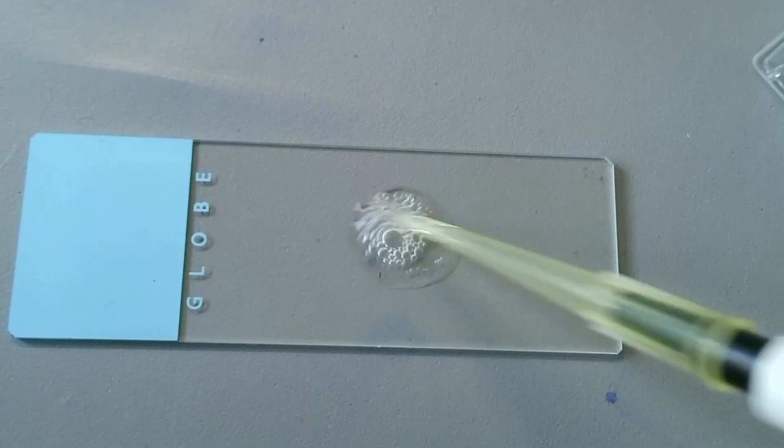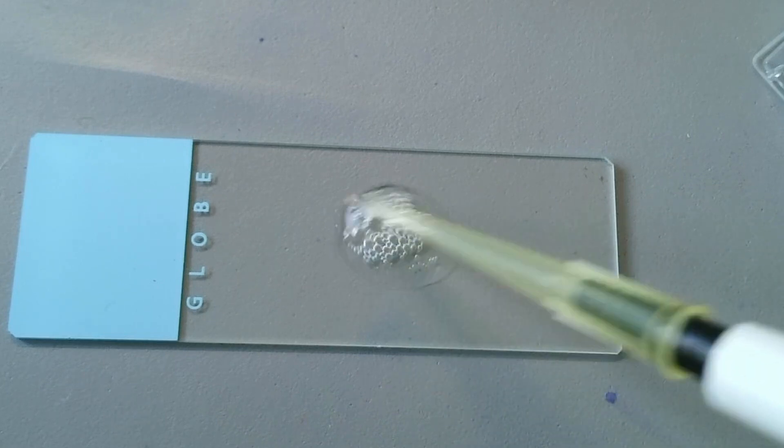And a little bit of a disadvantage, again, of course, is that sometimes there are quite a lot of bubbles formed this way. But generally, when you put the cover glass on top, then many of the bubbles are actually pressed to the side again and disappear. So even that is not a big problem.